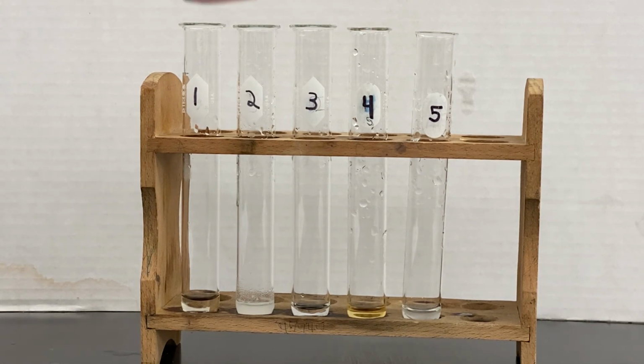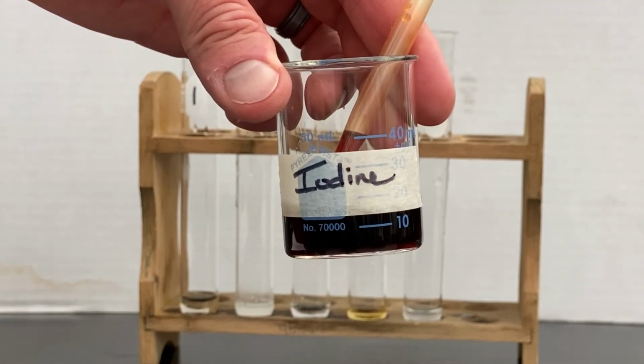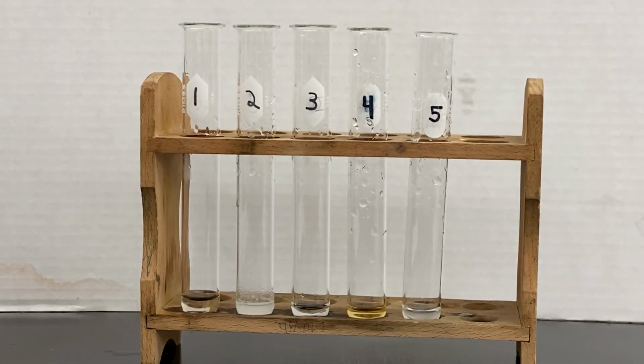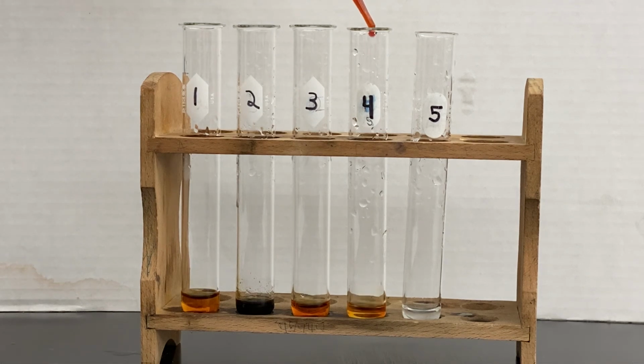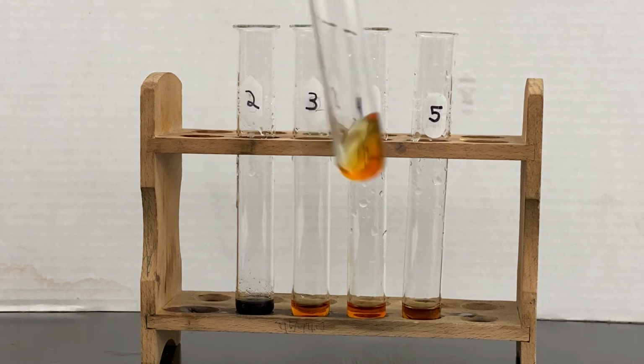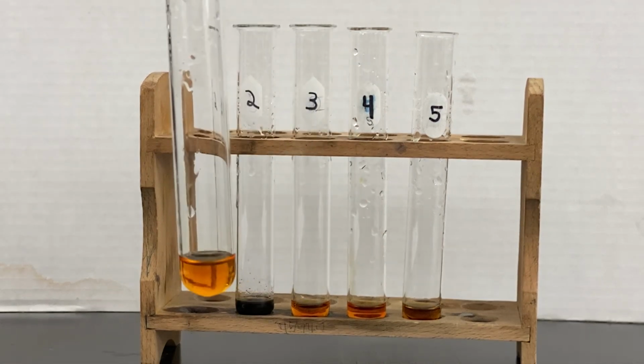Now I'm going to add 4 drops of the iodine chemical indicator to all 5 test tubes. And I'm going to swirl each one of them and give you a good look.